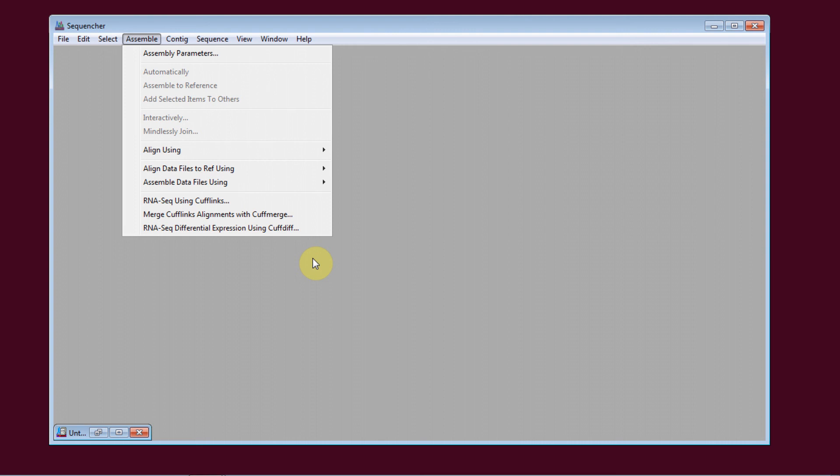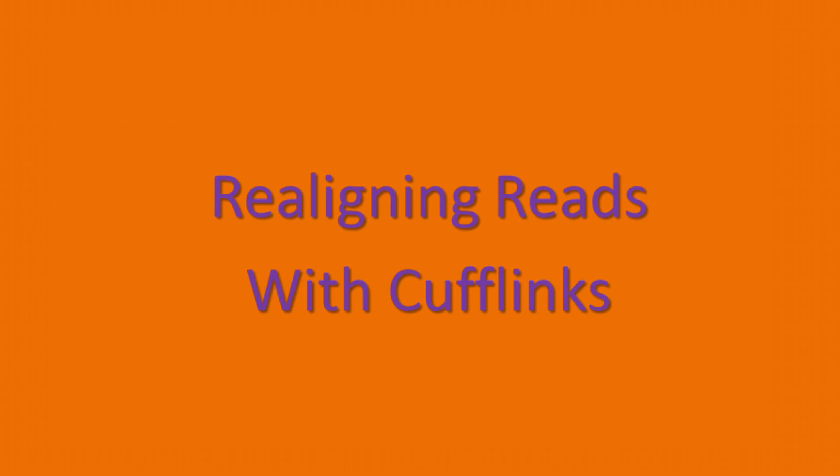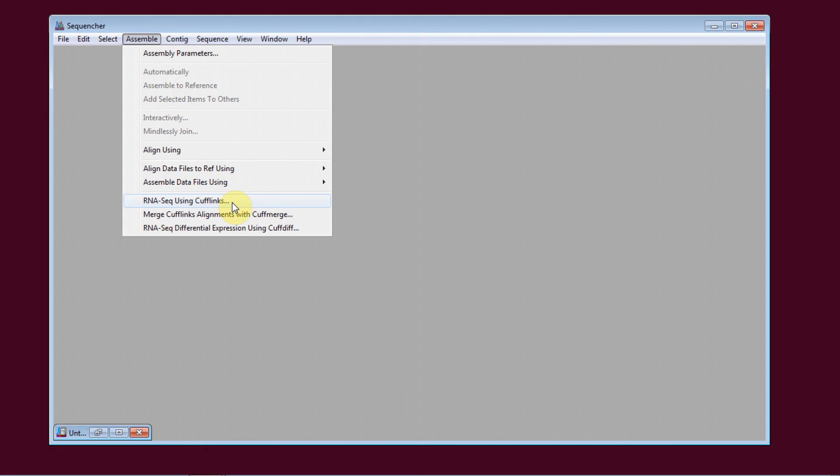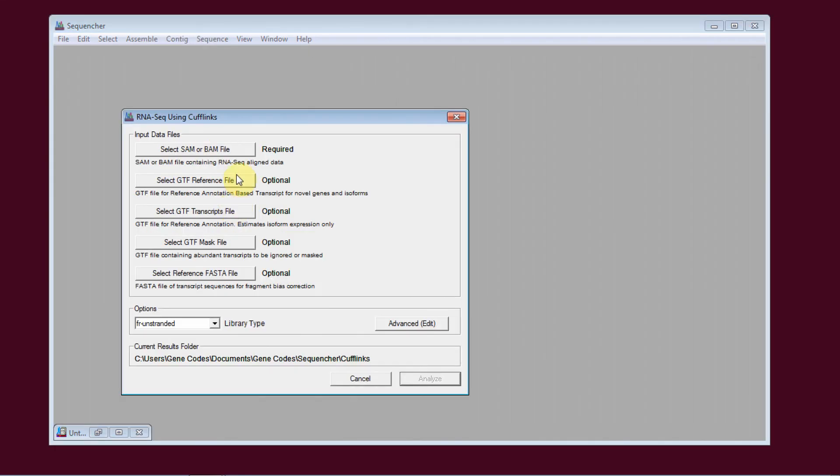I'd like to briefly show you how to look at differential expression in Sequenture. The first step is realigning your reads with CuffLinks. You go to RNA-seq using CuffLinks.